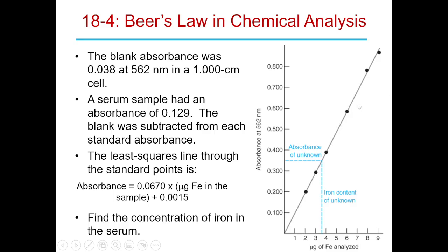Okay. So how do they know which wavelength to use? This is the maximum absorbance. So you would go through and find the largest one. Ideally, it would be off on its own without any large peaks next to it. Using the maximum absorbance is going to minimize any interference from other peaks.